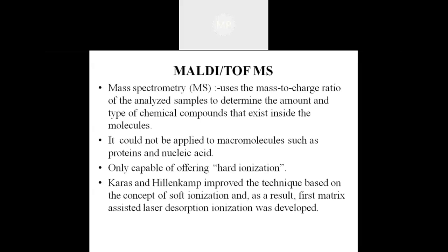Now moving to the next slide, the next technique is MALDI-TOF MS. MALDI-TOF MS is a mass spectrometry method. I am going to explain very briefly about mass spectrometry, because we already discussed it in our previous sessions by our colleague, Ms. Totrina Das.